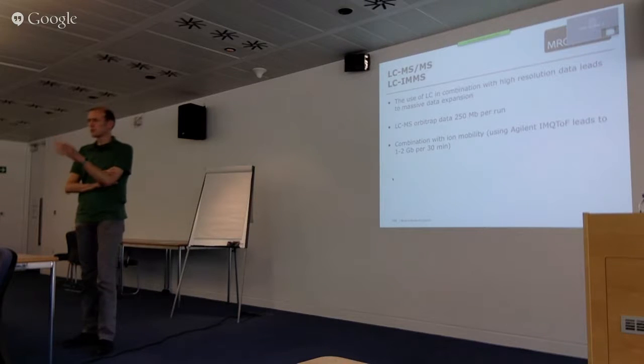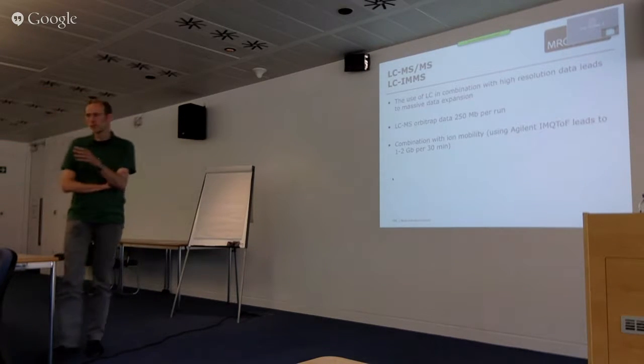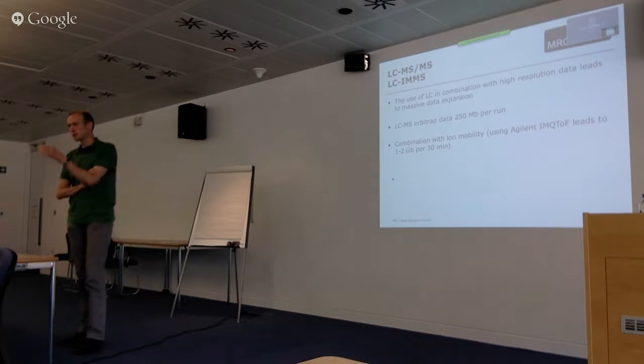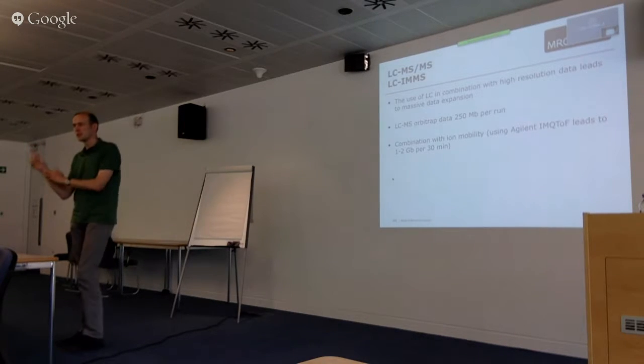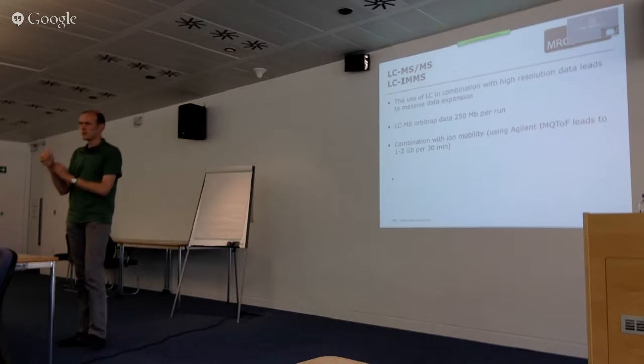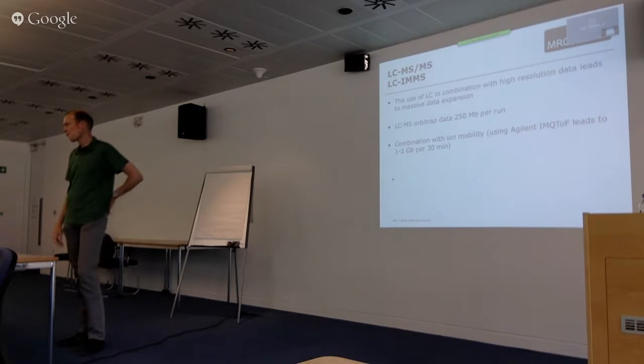It really depends what you want to do with the data. If you want to store the raw data and do something with it, you will need all that raw data with it as well. If you're a non-mass spec person only interested in the results, then you're only interested in the results table, but even in there you would like to see the QC, if you're a bit analytical. I think it's all wrapped up in this question.